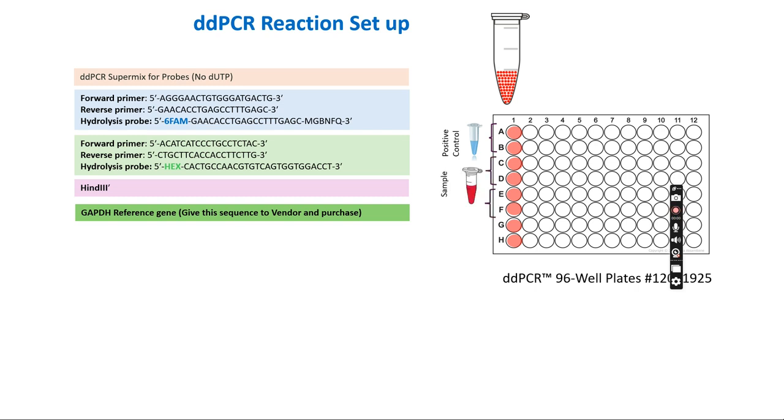And the next two sets of experiments I usually choose for my sample, and you shouldn't use very highly concentrated samples. I'm not talking about details on sample quantity, how you can optimize it using NanoDrop, then using dilutions. I will not talk about details on that, but you should use very low sample concentrations, since ddPCR is very, very capable of detecting very low concentrations of your DNA.